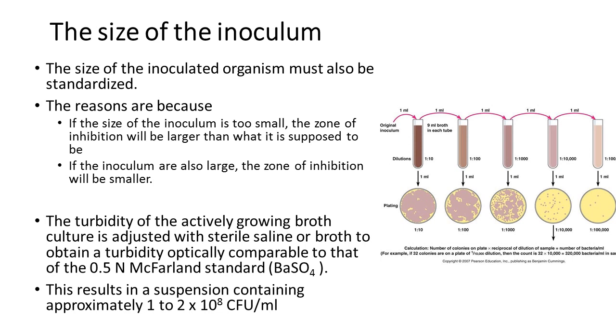The size of the inoculum. The size of the inoculated organism must also be standardized. Here we are using the 0.5 McFarland standard to standardize the inoculum. The 0.5 McFarland standard is prepared using barium sulfate, which is a turbidity solution.